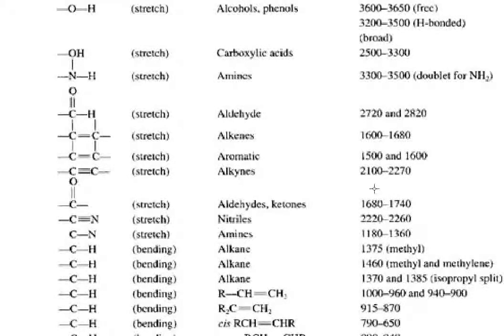Now, before we go further, one thing to note, you can compare a bit. Compare the CC triple bond stretch with the CC double bond stretch of an alkene. You can see that the CC triple bond stretch of the alkyne is a higher frequency than the CC double bond stretch. And that makes sense because the triple bond is a tighter bond than a double, and as I indicated before, the tighter the bond, the higher the frequency.